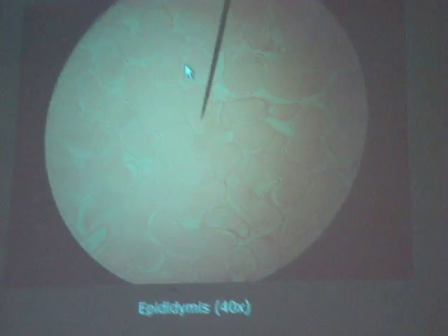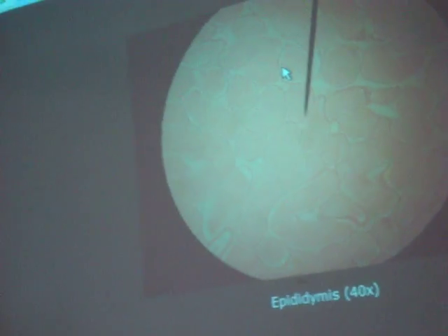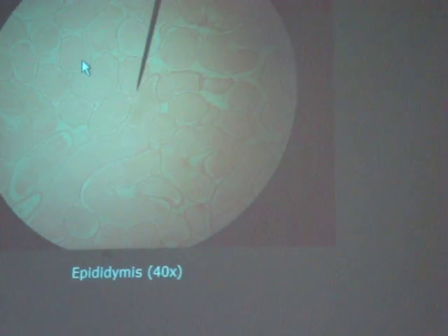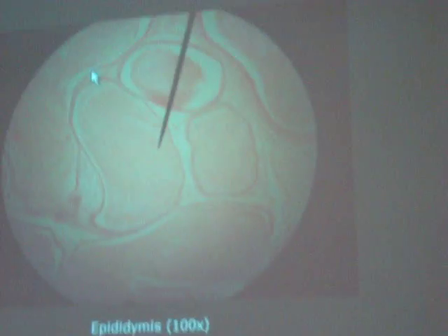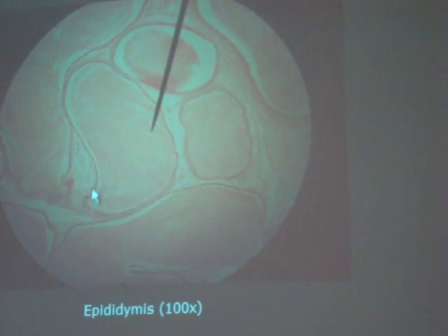Okay, so the epididymis, if you think of this like a network of tubes going around, all we've done is taken a cross section of these tubes. So right here would just be the cross section of the tube, whereas maybe this one is sort of more lengthwise. So the pseudostratified columnar epithelium is what surrounds these tubes right there. Okay, that dark single cell right there.